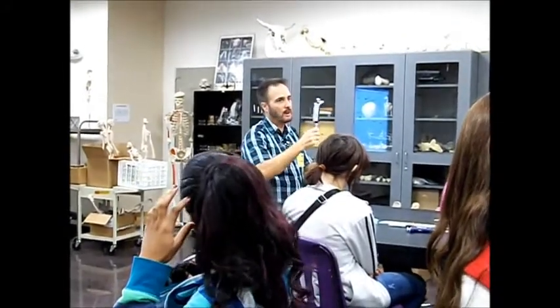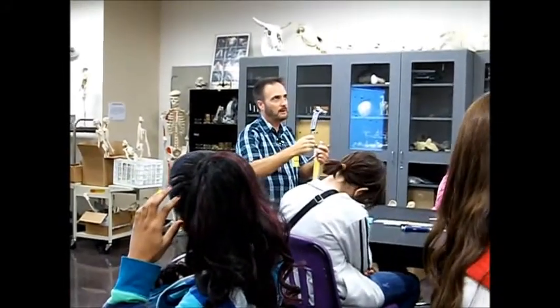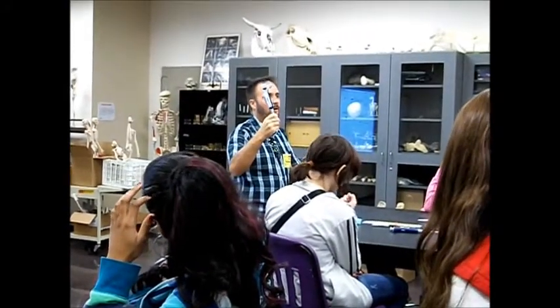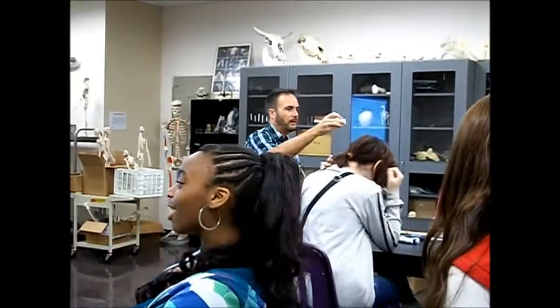225. Yeah, you could do 200 and then change it and add 50, or if you wanted to not have to change the measurement, you could put what? 125. Like 125 and put it twice. How about that? Yeah? So you're going to get that into both these tubes.